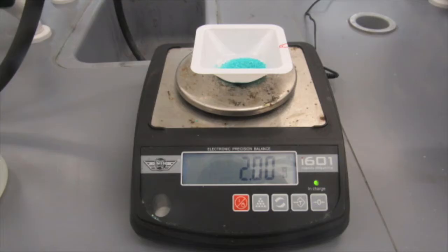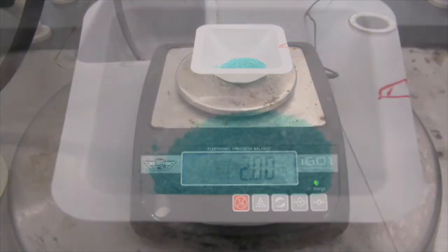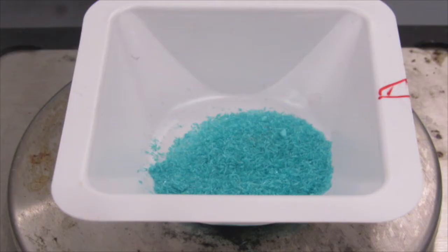Here we start with about 2 grams of copper chloride. As you look closer at the copper chloride, you can see it's a blue, bluish-green, crystalline type substance.